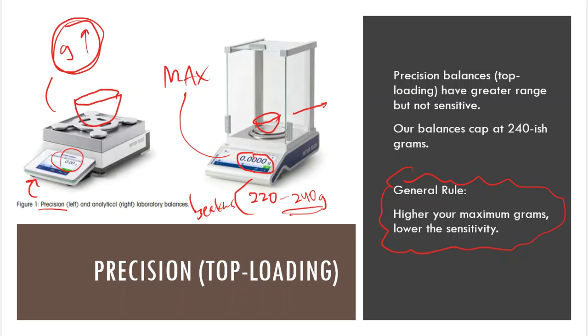All right. So just to prove, listen, yeah, there are maybe areas in a laboratory that need pounds and kilograms of material. And those are more on the manufacturing side of the house. But here in a testing laboratory, we're using these analytical balances. So what I would say here is that this, for what we do, is going to be the manufacturing side, and this is going to be for the testing side. Once those things are manufactured and made, we often have to test those to make sure they're quality. So this is where we use those balances. However, this is not the only option.